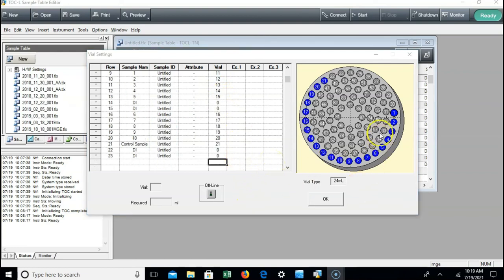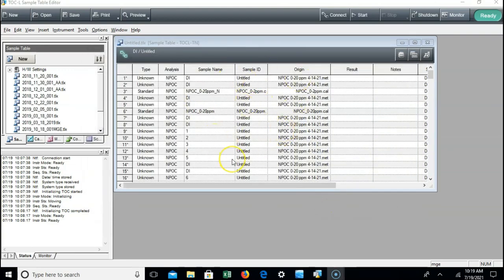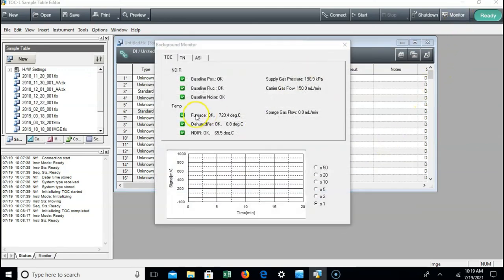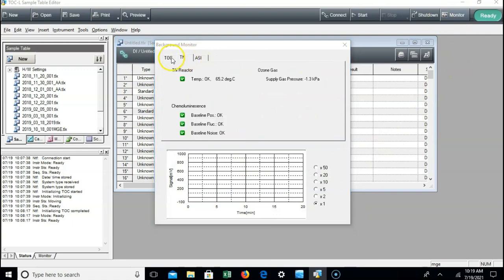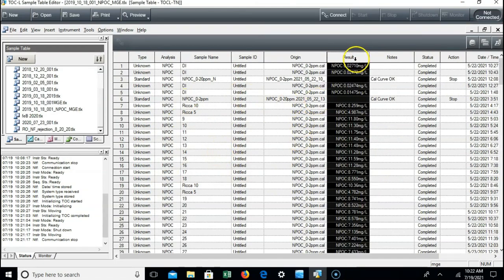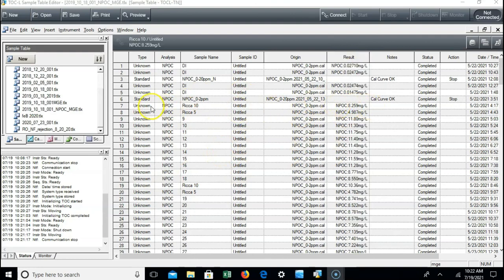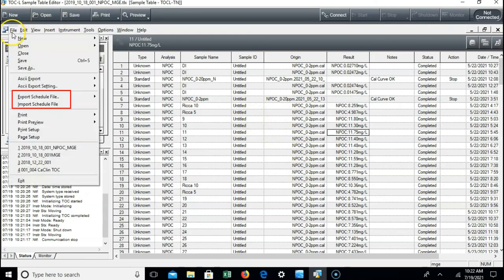Once all of our samples are in the right locations and the sample table is in order, look for the green ready button in the top right and hit start to begin your run. Samples will take about 10 minutes each, so be sure to grab and clean your vials after they're done so the next person can use the instrument. Once your run is complete, the results column will have all of your results — the instrument has taken multiple injections and presents the result within the specified standard deviation. You can export the data via file at the top left, choosing an Excel file or text file with varying levels of detail, from basic results to complete injection details, processing details, and peak areas.